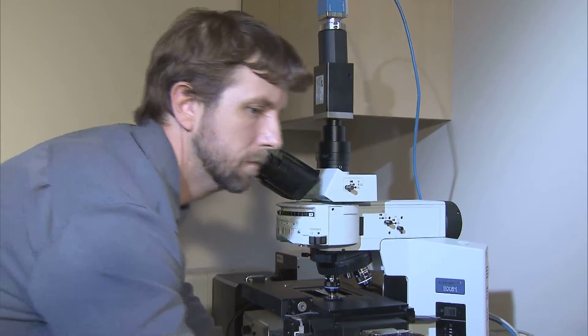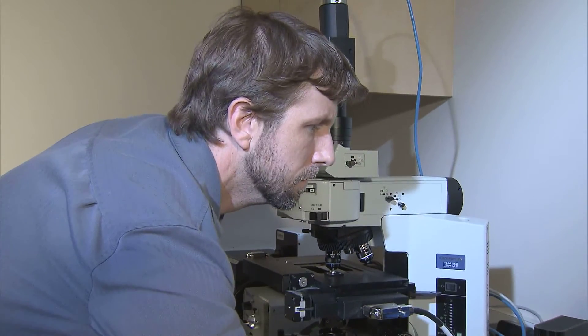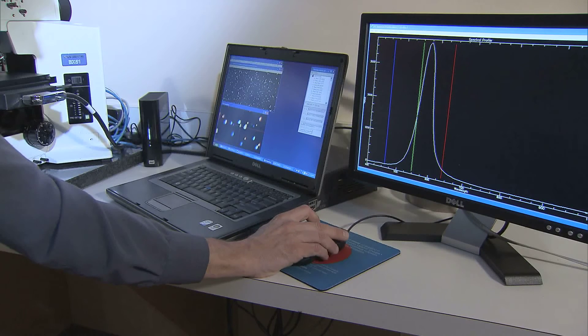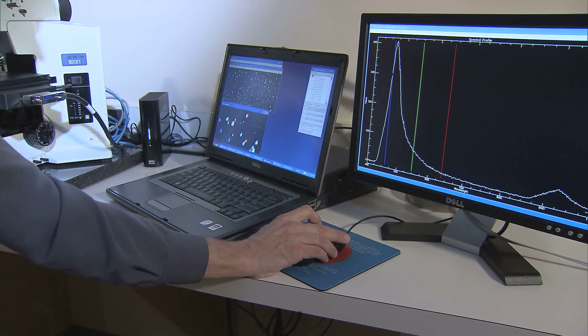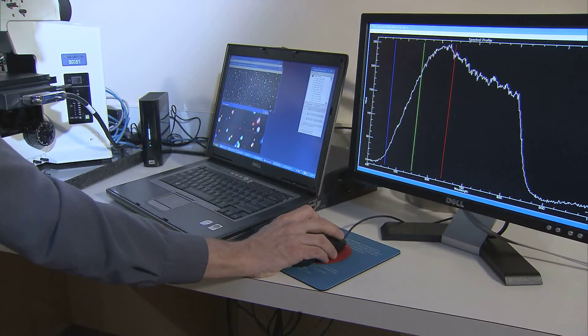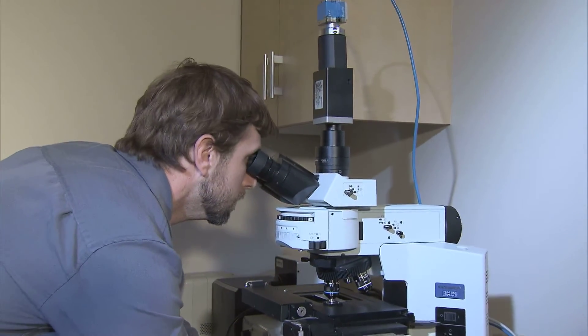The spectral image file is then opened in the image analysis software. These spectral files appear as an RGB image, which is virtually identical to the optical image observed in the microscope eyepiece.